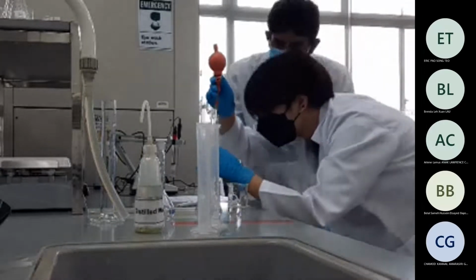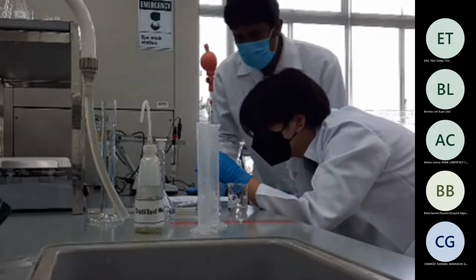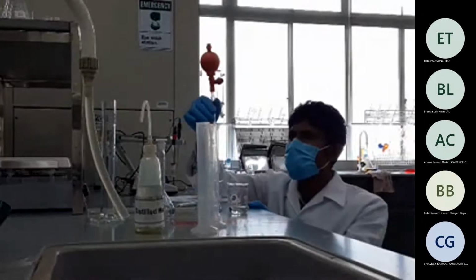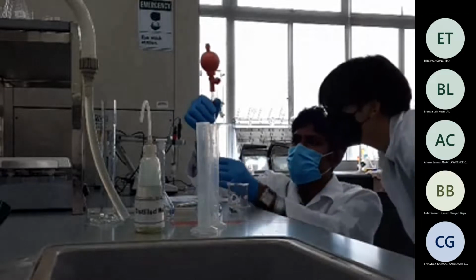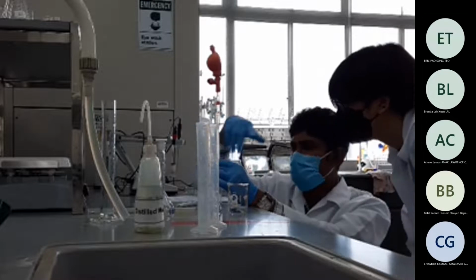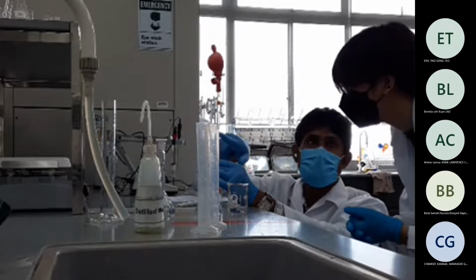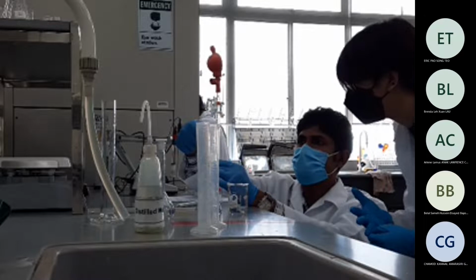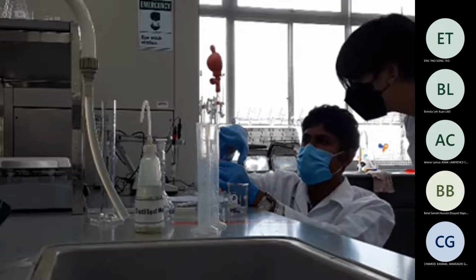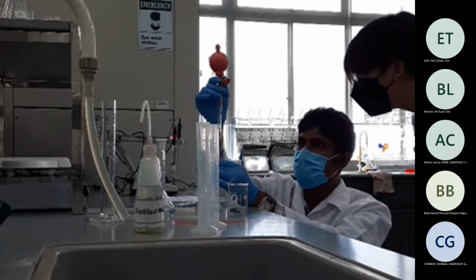You have to be slightly... Is the meniscus touching the lower line? Can I see? A little bit. Put your eyes together, level with the line. My eyes are on the level, and I see that the surface of the liquid is lower than that. So it's not accurate. I have to take a bit more.